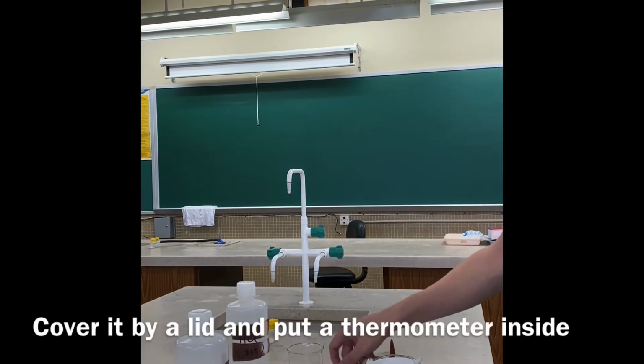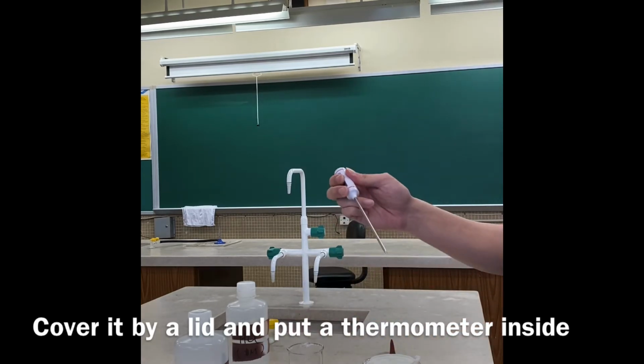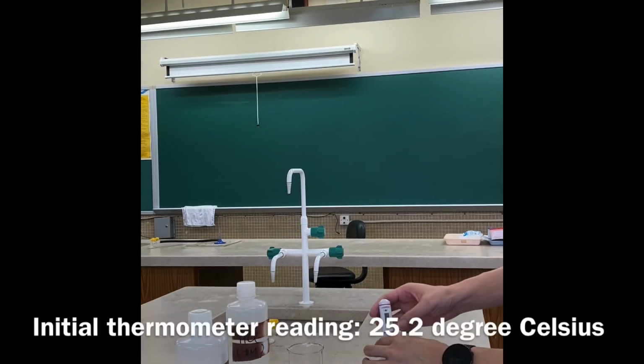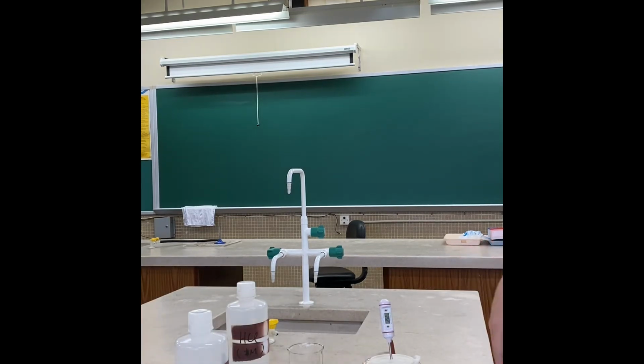When all the 25 ml of acid is transferred into this cup, we can cover it with a lid and put a thermometer inside. Starting from this point, you have to record the time until the thermometer reading stays constant. Now it should be 25.2 degrees Celsius. We have to keep tracking its temperature to ensure that initially it is a constant value.